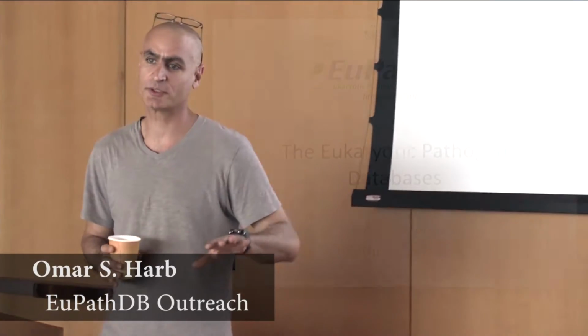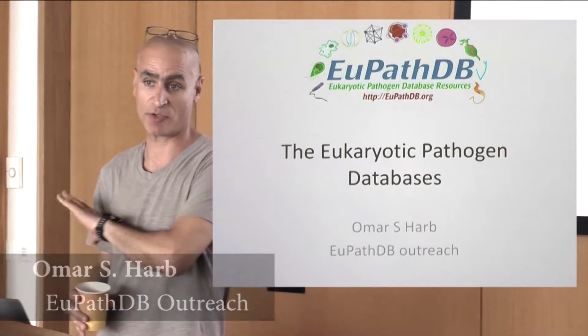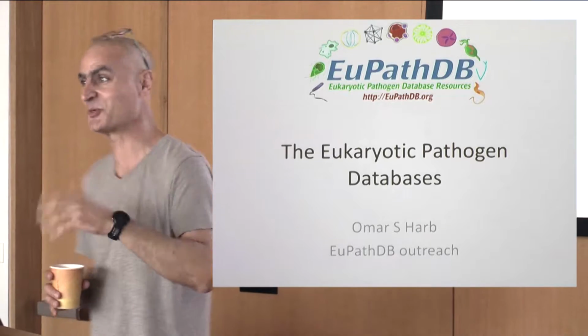I'm going to give you just a short intro, and then mostly I'll be doing live demonstrations using a website that is freely accessible by anybody. So the idea is that if it doesn't work while I'm showing you, then it doesn't work for you. So it should work.